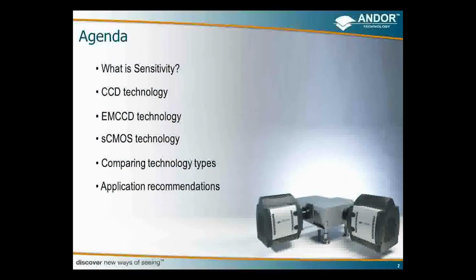Thank you. Welcome everyone to this webinar. It's called Ultrasensitive Imaging Technologies for Microscopy. So really the rationale for presenting this is an acknowledgement that there's a number of scientific imaging camera technologies out there from which to choose. So I wanted to give something that was geared towards low light fluorescence microscopy in particular. And so that kind of sets the agenda.